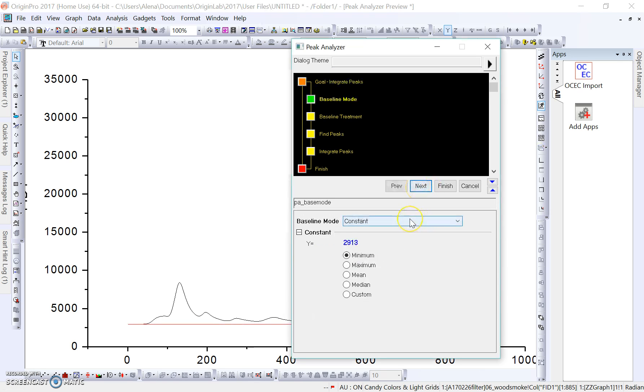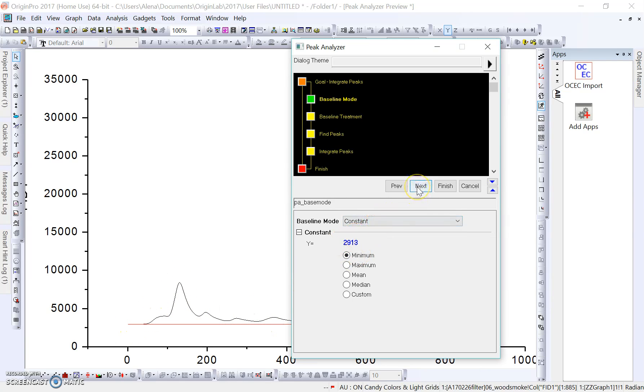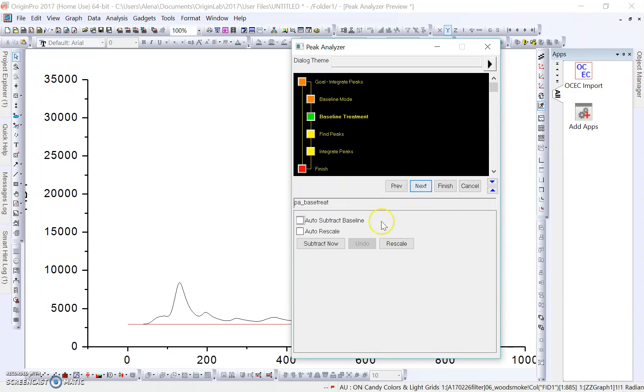This is just what we want our baseline mode to be. In this case, we're going to have a constant set at the minimum value, so the minimum value of the FID1 signal here. We'll click Next again. In this one, we'll also click Next. There's nothing that we want to click on this box.